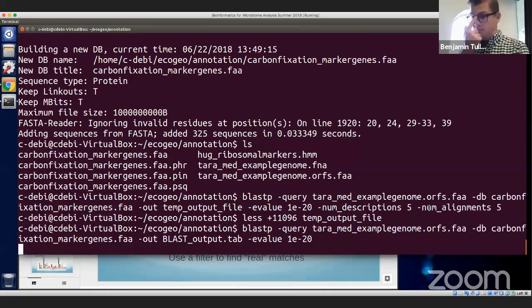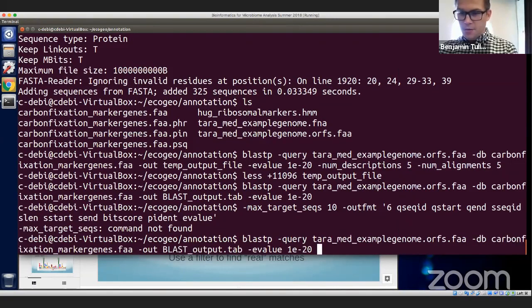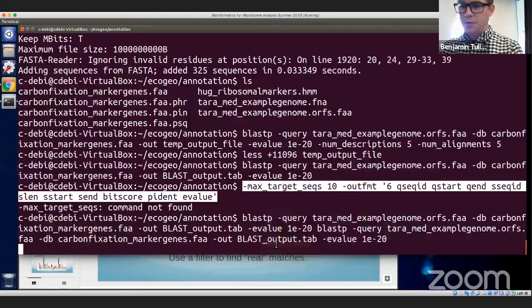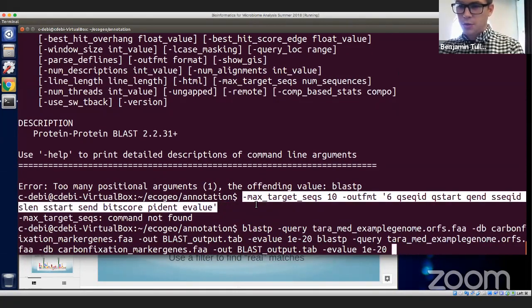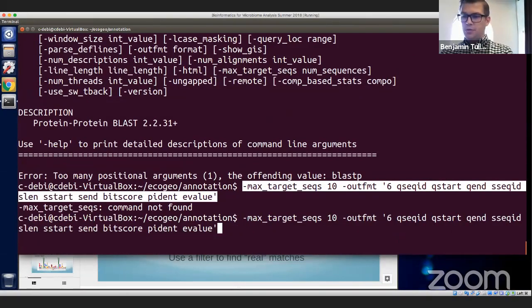And that'll run. Oh, okay, that was my fault. There's an extra return in the PowerPoint. Nope, that's not what I wanted to do. So if you're running this, you need to look for both of them. I'll highlight this in a second. Oh, and there's two here.